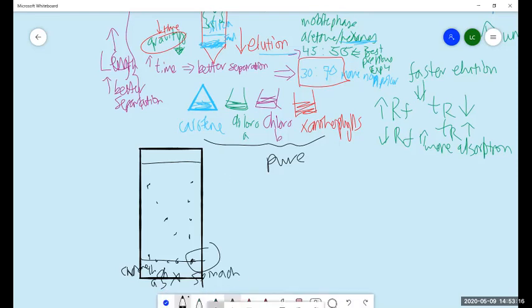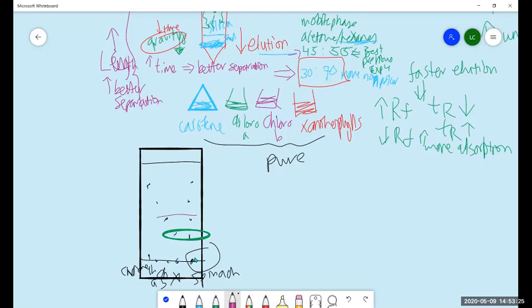And then all we were trying to do, it might not have been perfect like this, and you might have had residue. So you just look at the samples and match them up. I'll use the same color scheme. I had carotene as light blue, this sample chlorophyll A, this is chlorophyll B, and then let's say the red one was xanthophylls.